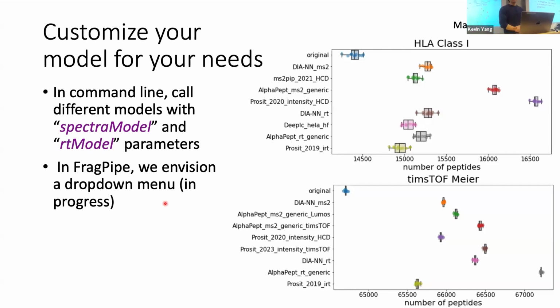So it actually looks really poor. And so that's why I have a lot of QC plots that are generated to show you if your model is acting suboptimally, right? On a more fundamental scale, how do you correct for that? Do you need to train a model that will be optimized for every single instrument or PTM or something? That might be something that we have to do, but it's also a piece of meta information that you can include in models to help you modulate your predictions a little bit.